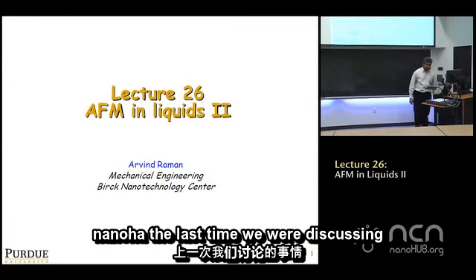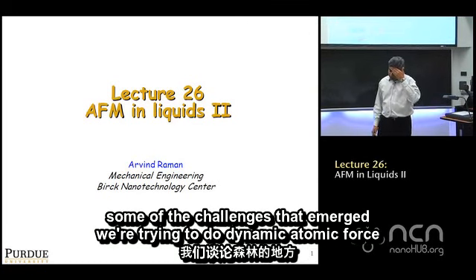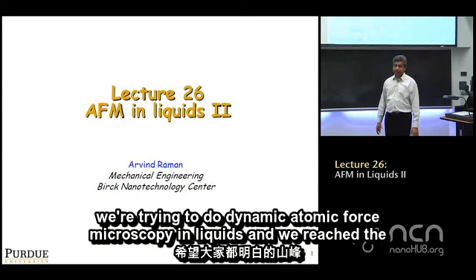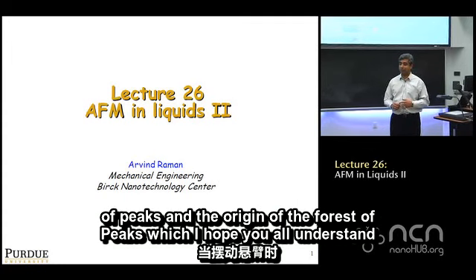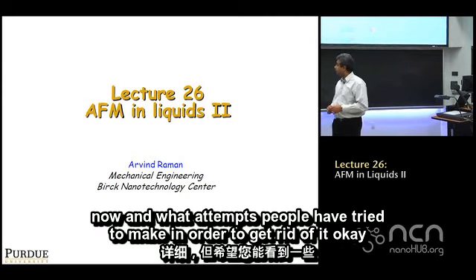The last time we were discussing some of the challenges that emerge when trying to do dynamic atomic force microscopy in liquids, and we reached the point where we talked about the forest of peaks and the origin of the forest of peaks, which I hope you all understand now, and what attempts people have tried to make in order to get rid of it.